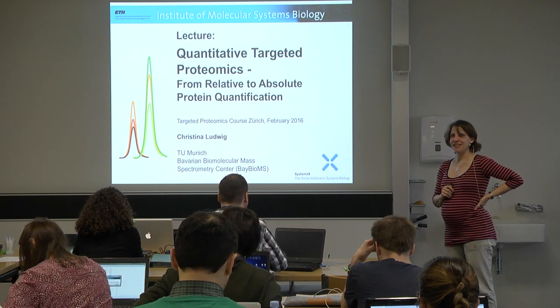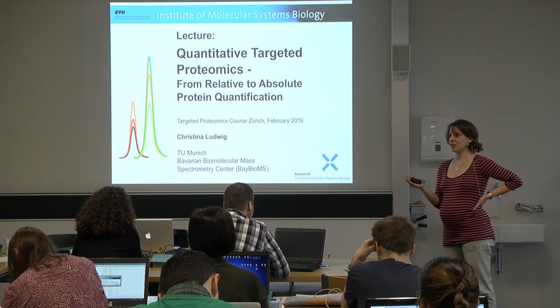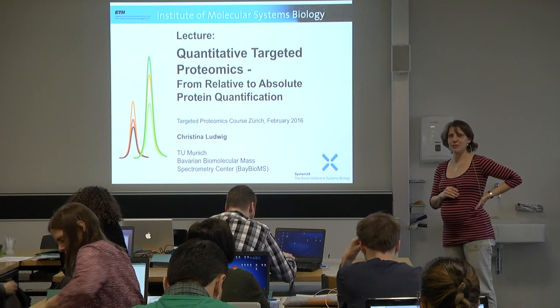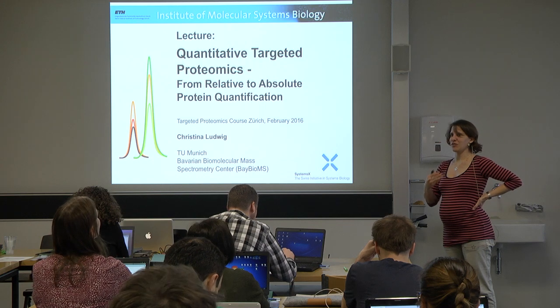As I already said yesterday, you learned already, hopefully, a lot about how to set up a targeted proteomics experiment. You also learned how the data looks like that the instrument will give you back, and you have also learned how you can identify quite confidently your target peptides in your data.